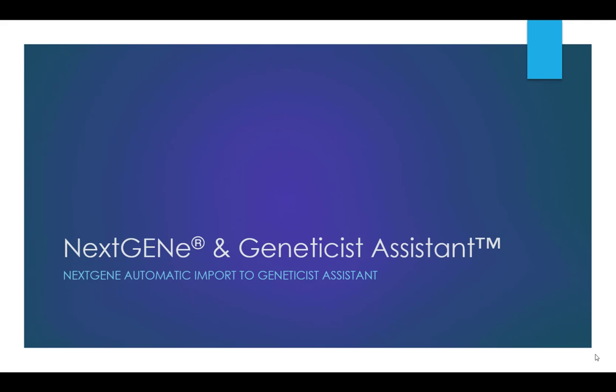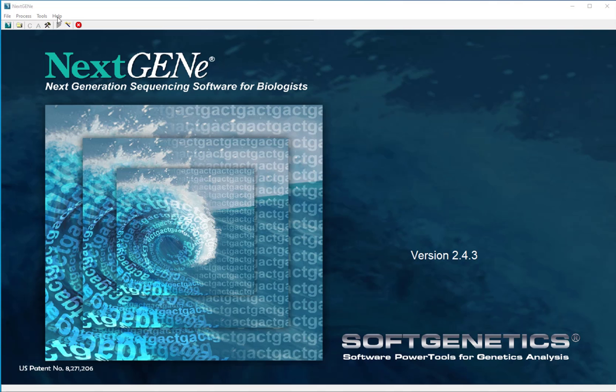VCF and BAM files generated by NextGENE Analysis can be set to automatically import to Geneticist Assistant when a project is completed. This can be easily configured when creating projects in either the Project Wizard or using AutoRun. For this webinar, we'll pick up assuming both NextGENE and Geneticist Assistant have already been installed.